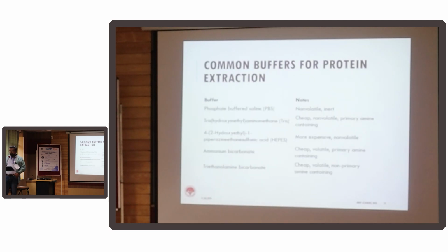This is a table where we have multiple buffers that you can use for protein extraction, and there are a few notes which tell us when not to use something and when to use something. I would request, whenever you plan a proteomics experiment, always go through the entire experimental procedure in your head before you start hitting the wet lab.